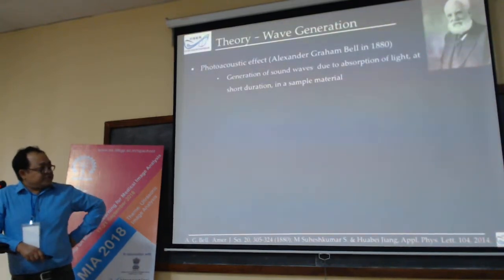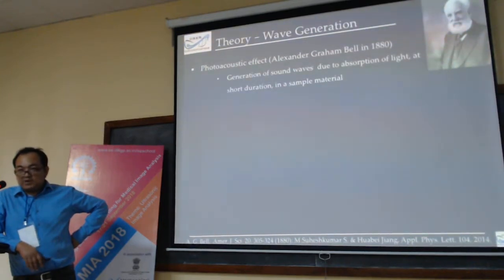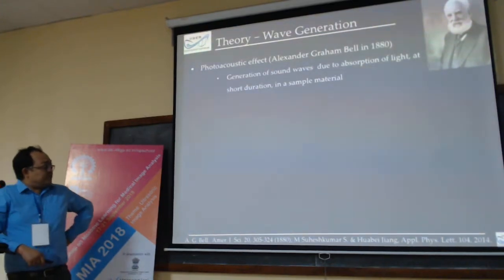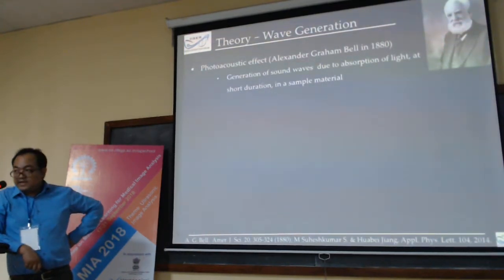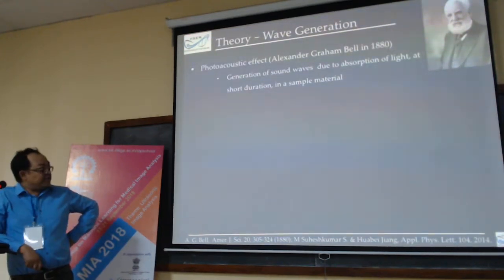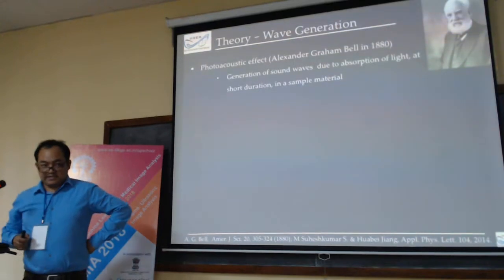So with these brief introductions about the potential features of photoacoustic imaging that drive the motivations, I would like to come briefly to the theoretical models of photoacoustic imaging. In principle, photoacoustic imaging is completely based on the photoacoustic effect propounded by Alexander Graham Bell in the 1880s, which says that there is a generation of sound waves due to the absorption of light, for a very short duration, in a sample material which has absorption and elasticity.